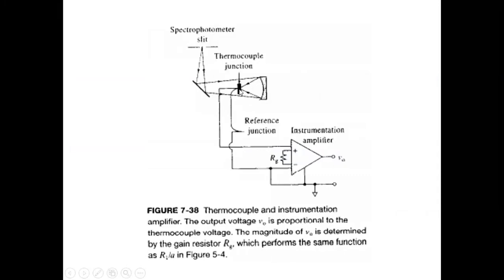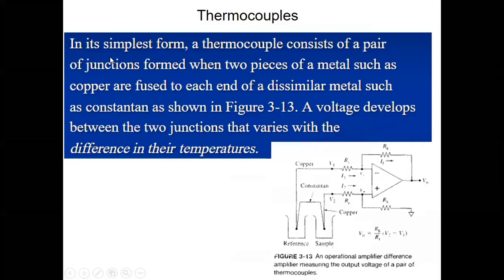Now because of the radiation, heat will be generated, and because of the generated heat, a voltage difference will be there, and due to that voltage difference, it will give a signal, and the amplifiers will amplify the signal, because there should be a way to amplify the signal. The generated signal is really small, and the amplifiers will be there to get the output voltage, right? So that is what's happening in the thermocouples.